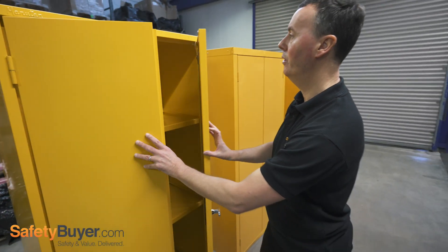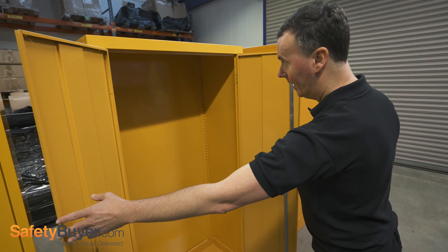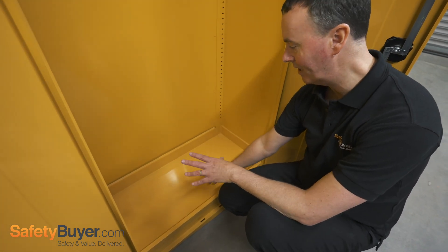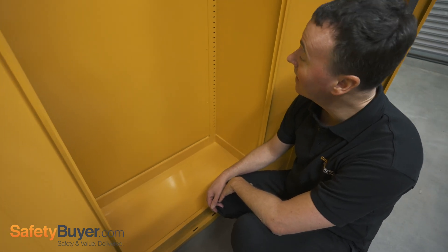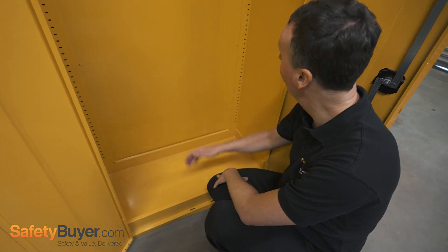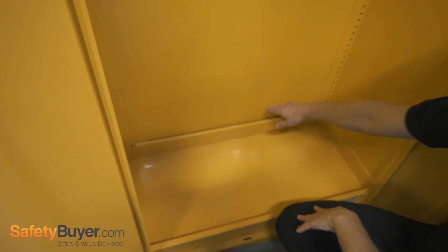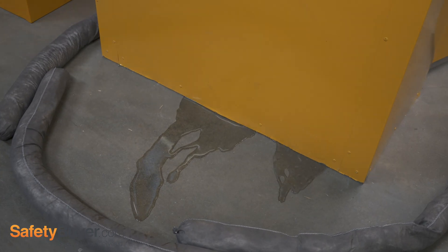So moving on to cabinet two, this is an example of a cabinet with a fixed sump, so this is not removable. The capacity is not great — somewhere around 25 to no more than 30 litres. And you can see the design here: in the same way we've mentioned about the first cabinet, a spill down the back or down the side of this cabinet would miss this tray and potentially leak out through the back of that tray.